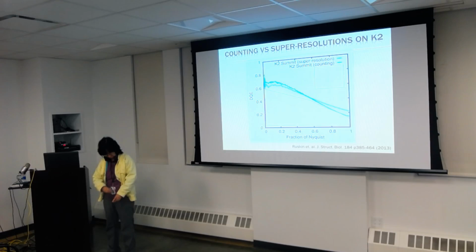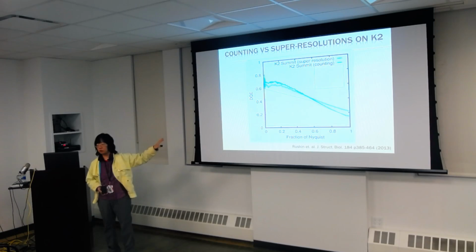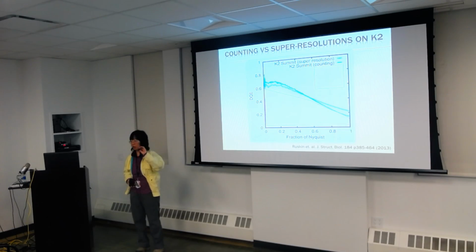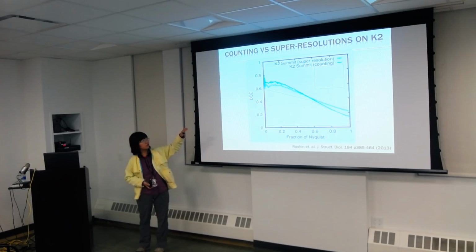Yeah. The other thing you want to think about really carefully is that if people start talking about these values, as well as what people can measure, it's very difficult to do. These measurements are really difficult, mainly because of the measurement of noise. So the small differences there, I would not be worried too much.